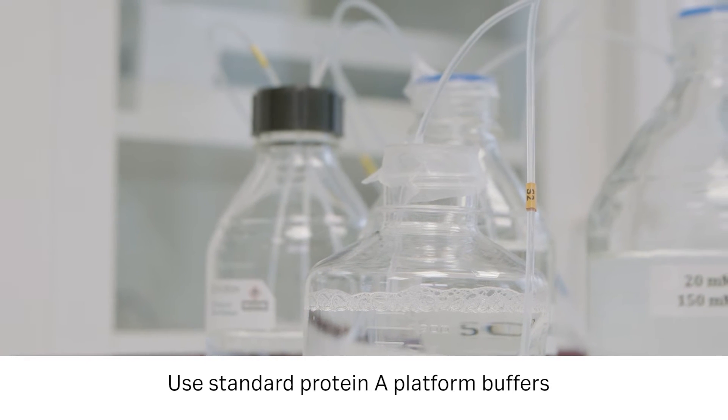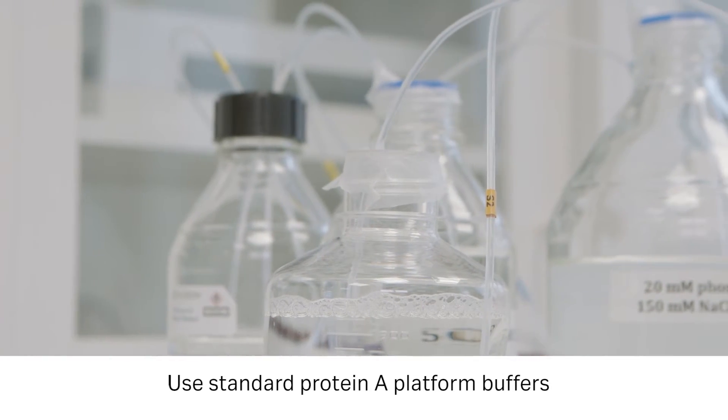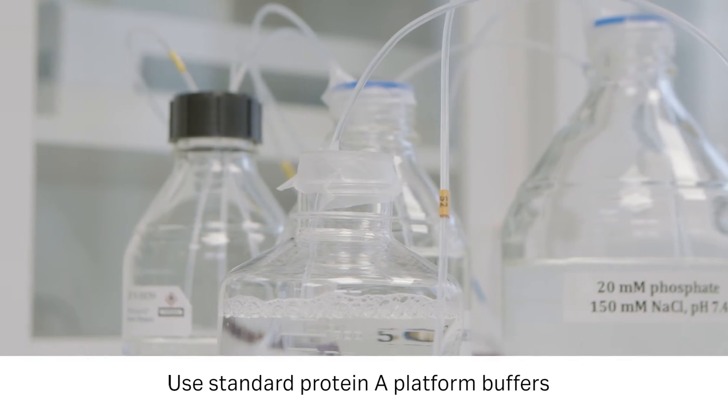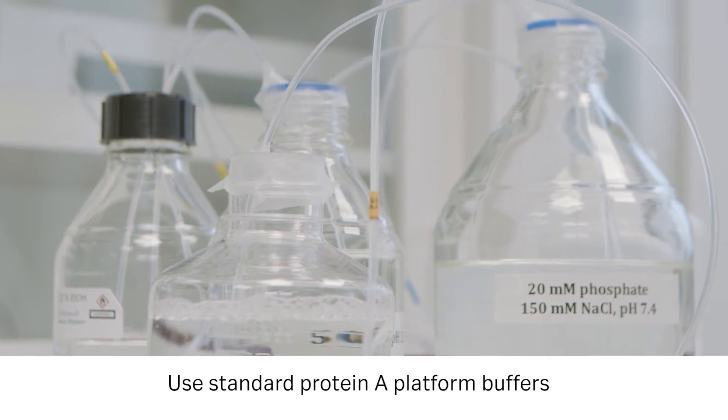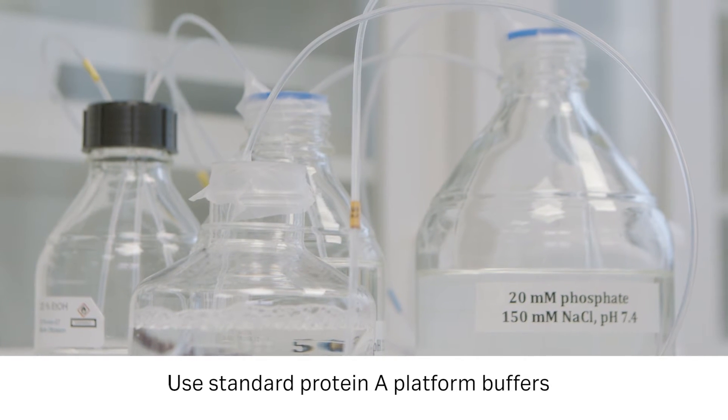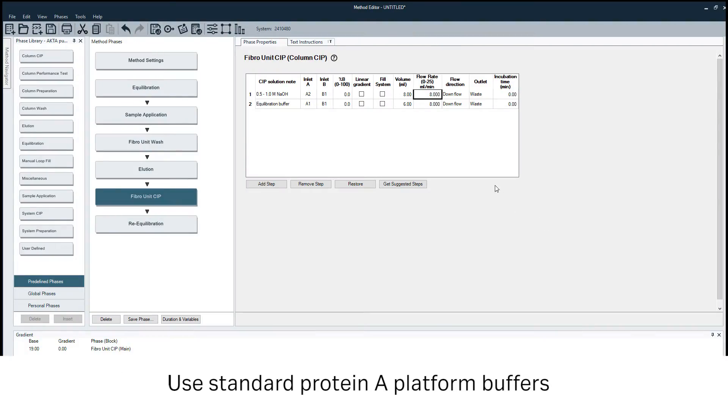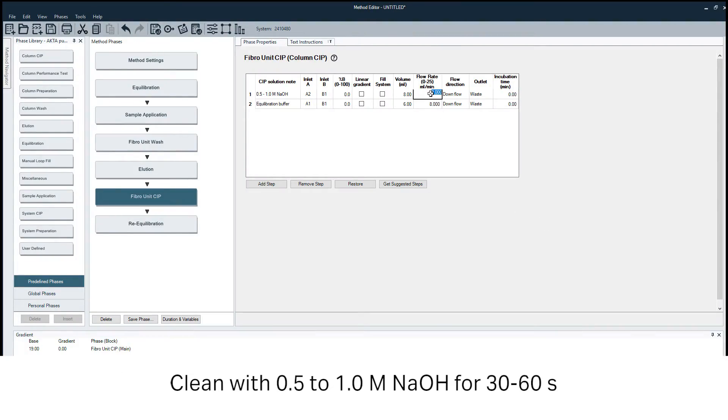Use Equilibration Buffer to wash after sample application. After the bound sample elutes, clean the unit with 0.5 to 1.0 molar sodium hydroxide.